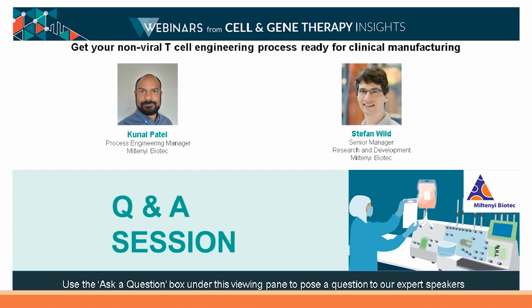Great. And if you do process large volumes with the electroporator, like the over 100 mils that was mentioned in the presentation, how do you ensure that the performance doesn't decline over time, for instance, by cellular debris accumulating on the electrodes? Kunal, do you want to jump in? Oh no, Stefan, sorry. Go ahead.